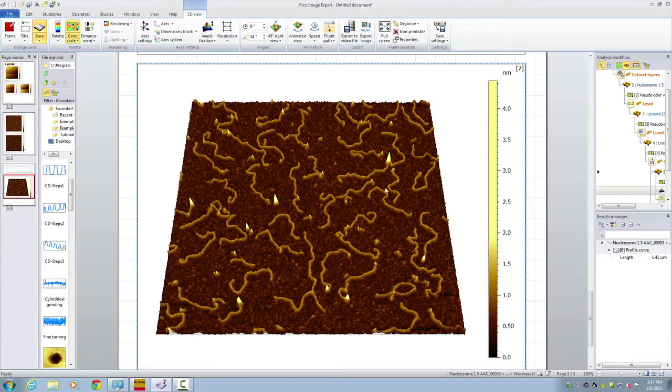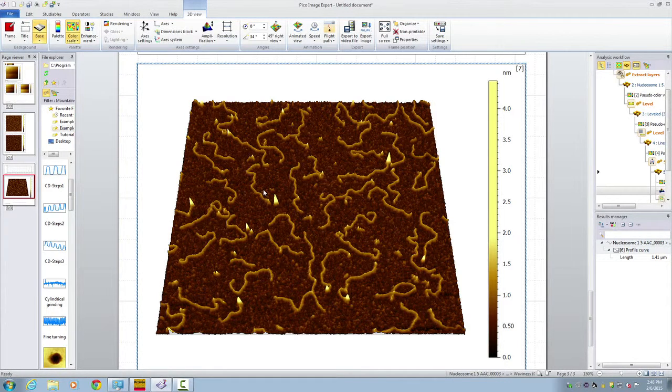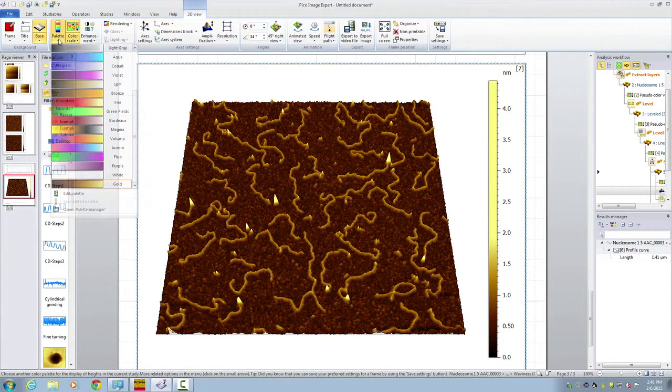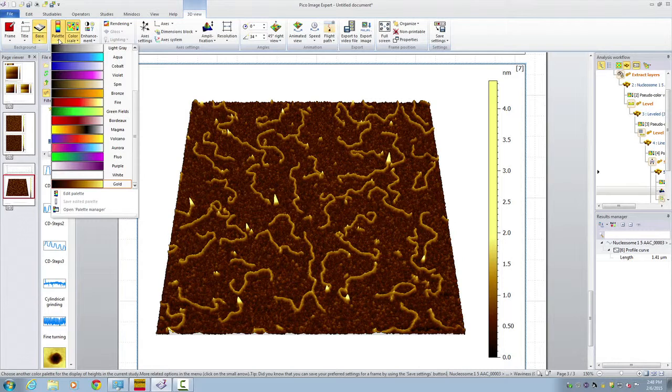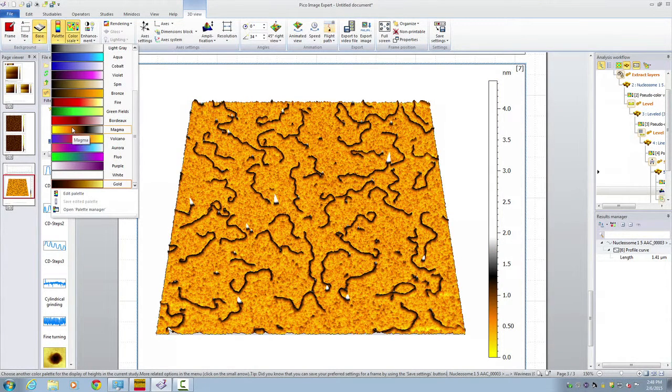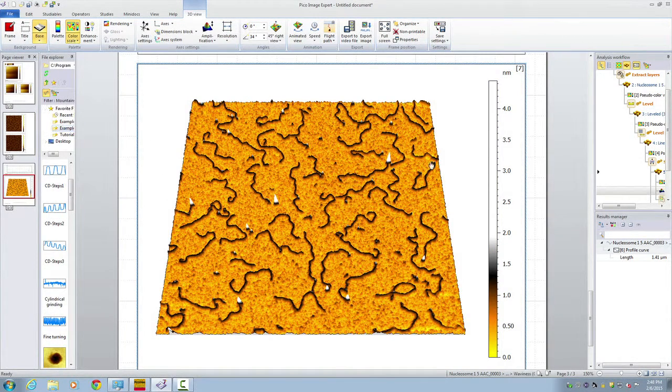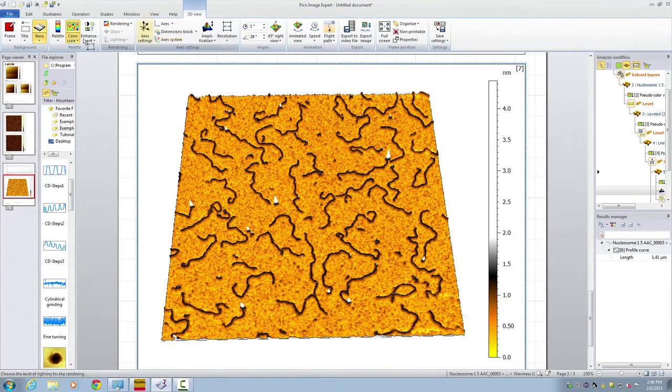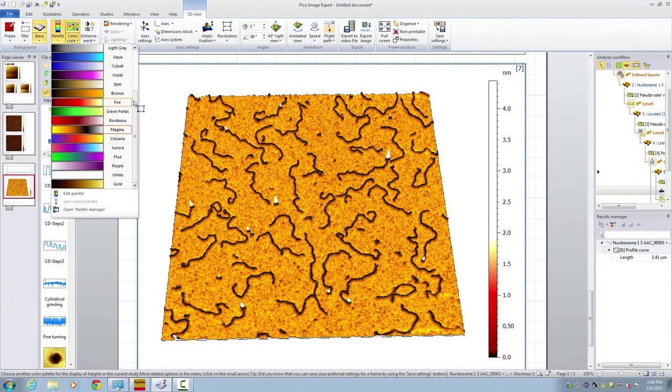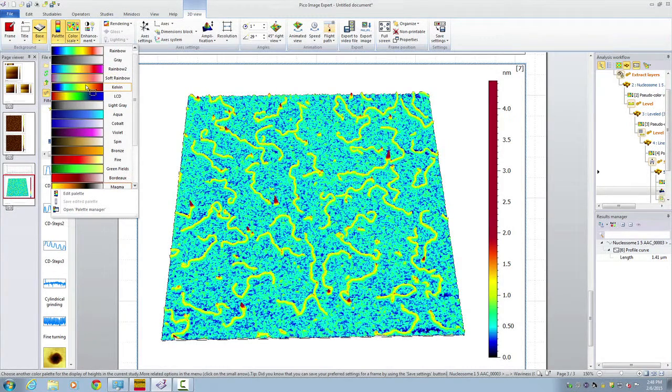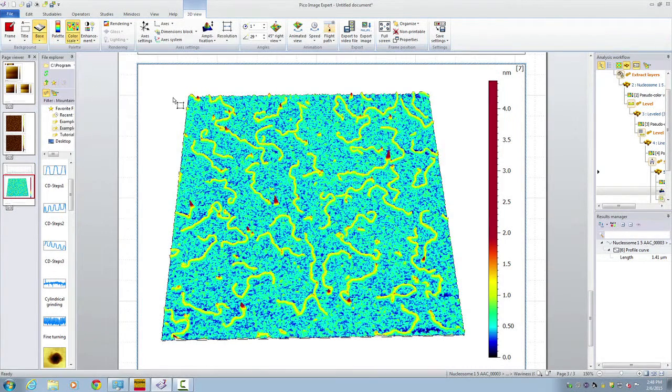Before we finish, let me show you also different kinds of color palettes. Here, you can choose different types of color. For example, this is an interesting color. Or we could choose this thermal color.